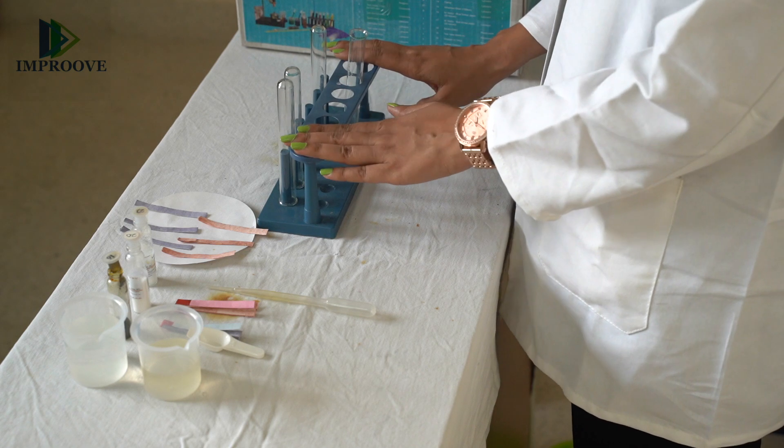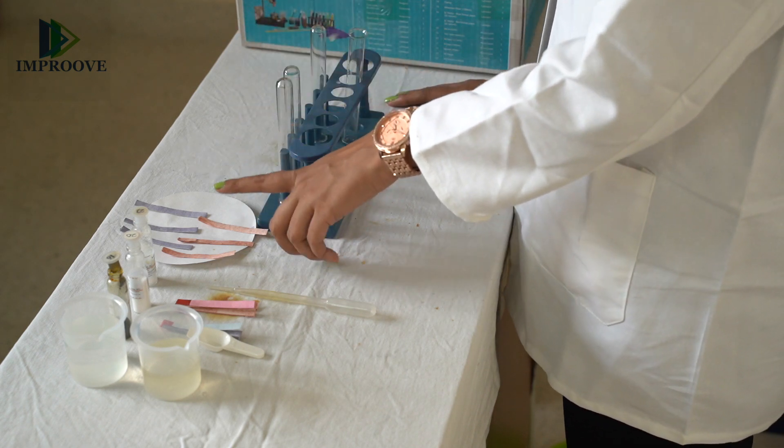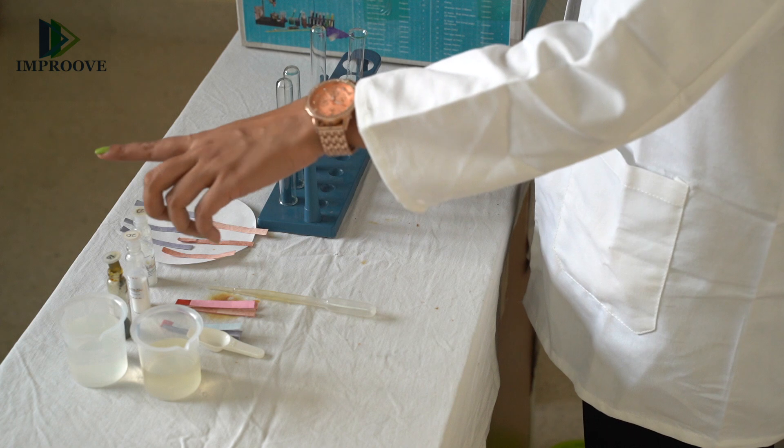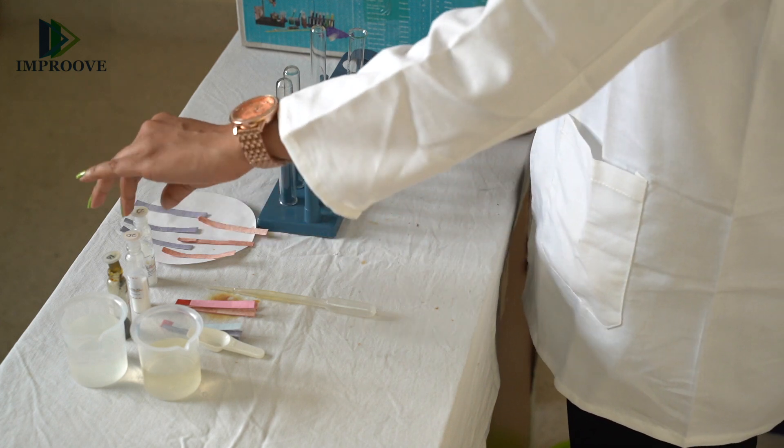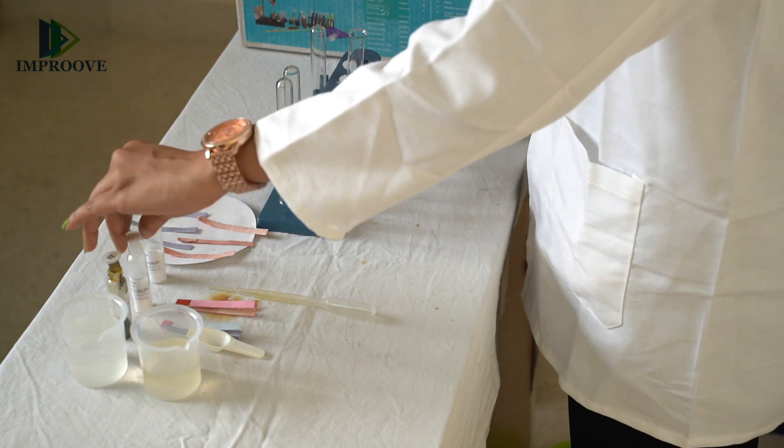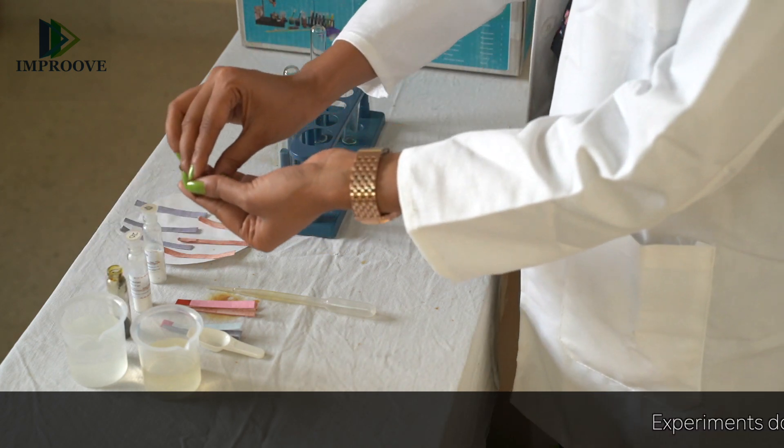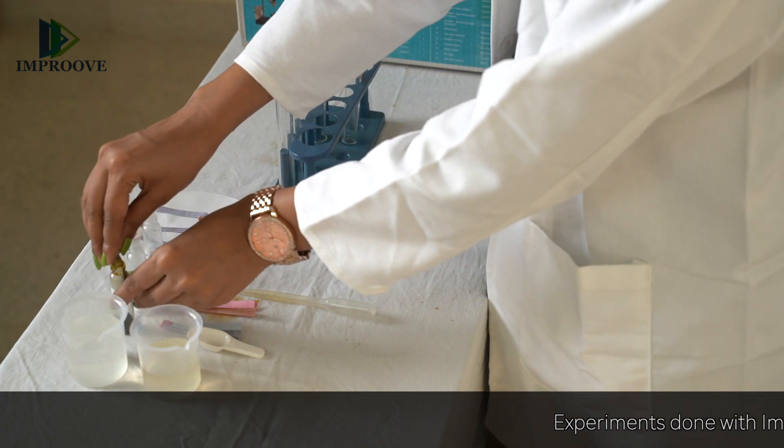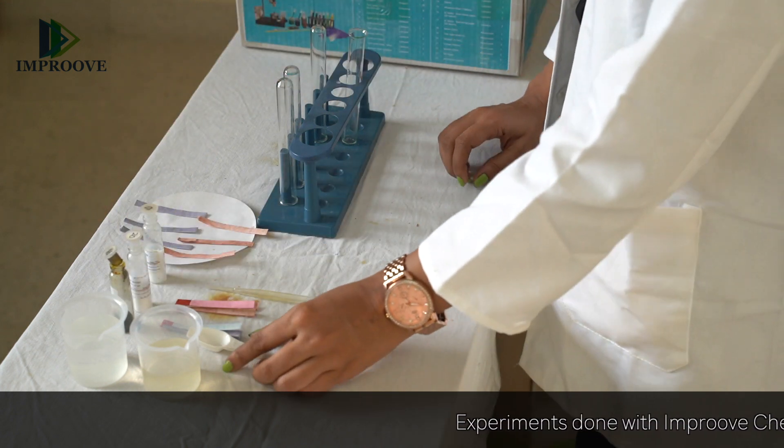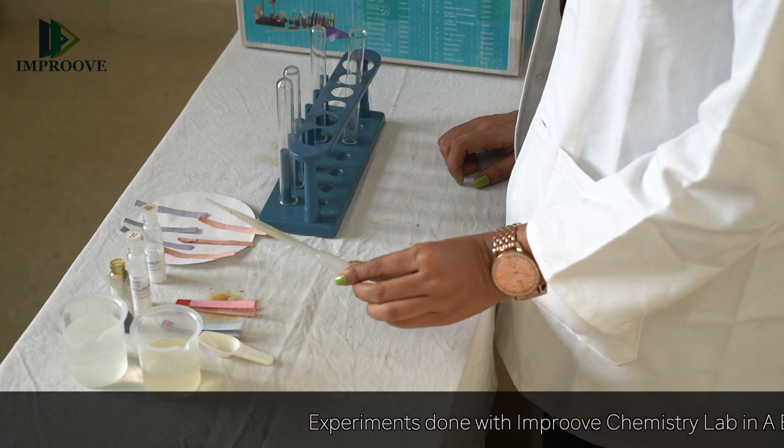For the experiment, you will need a few test tubes, red and blue litmus paper, three salts (sodium chloride, sodium acetate, and ferric chloride), two measuring cylinders, water, a measuring spoon, and a dropper.